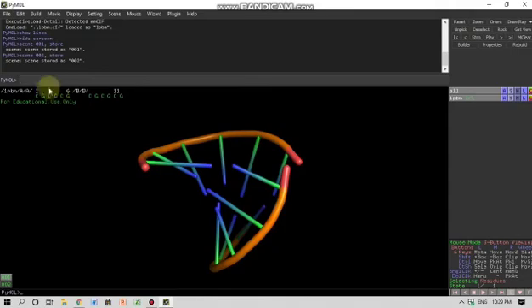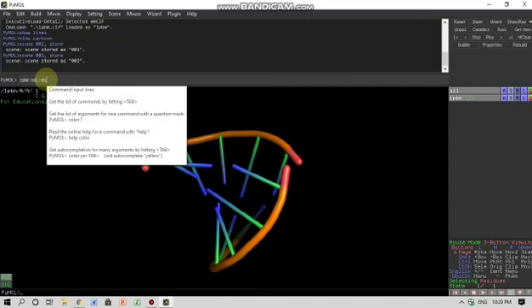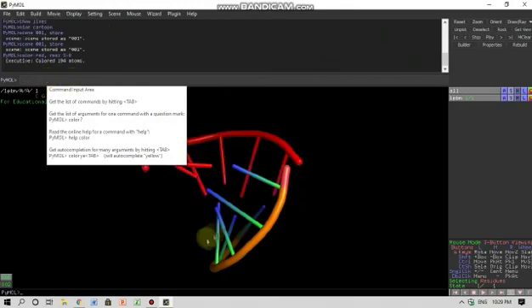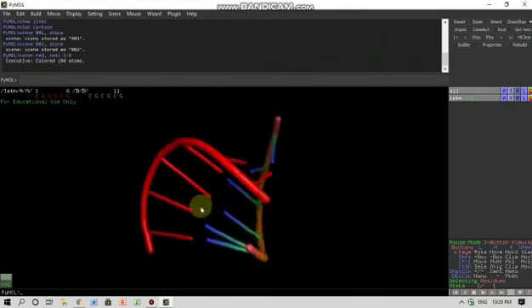I want to see the area from one to six as red. So I can write here as color red comma resi 1-6 and enter. So wow, this appears as red color here.